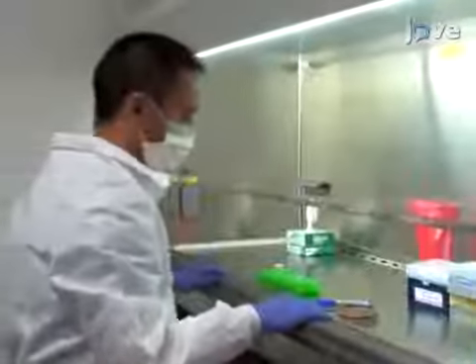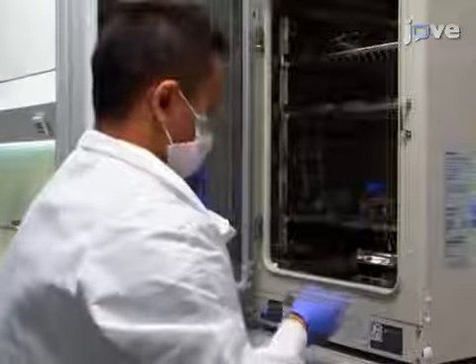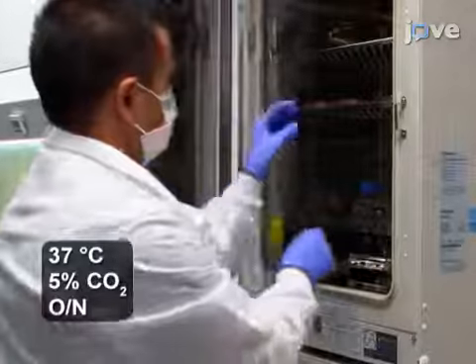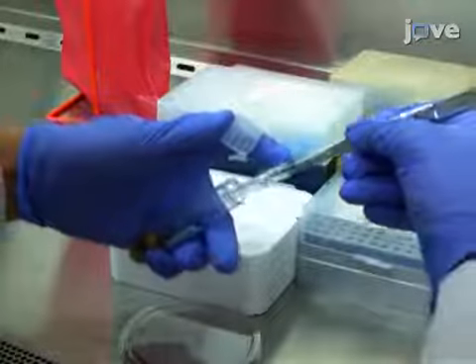To begin, plate the NTHI on a chocolate agar plate. Incubate the plate upside down overnight at 37 degrees Celsius with 5% carbon dioxide. The following day, culture the bacteria in a brain heart infusion broth.